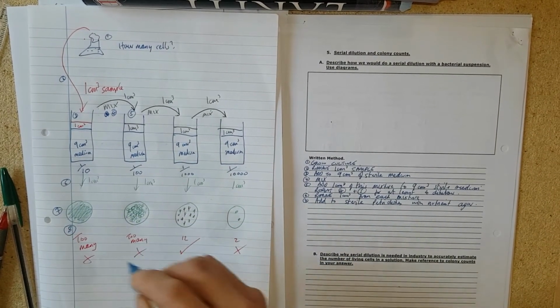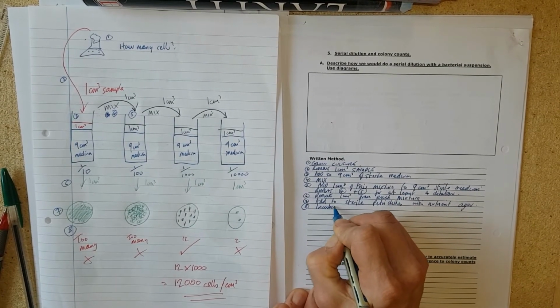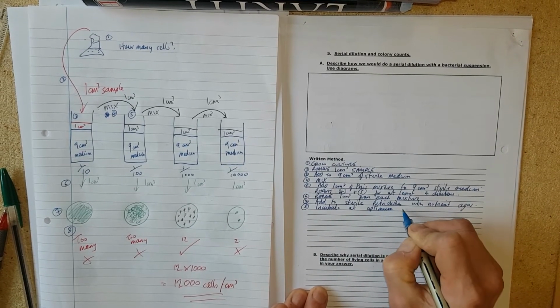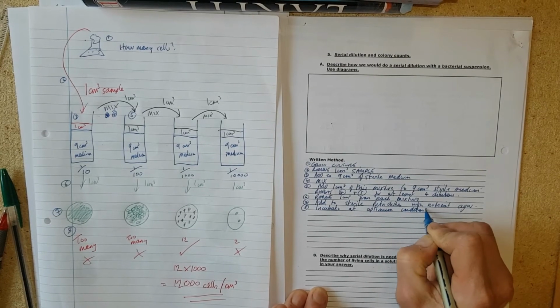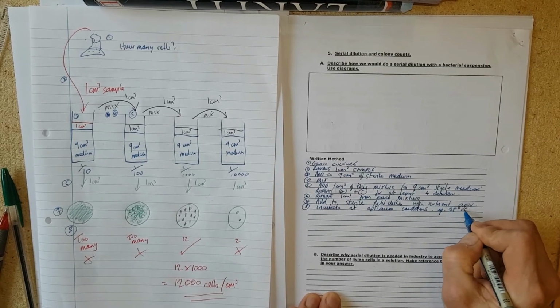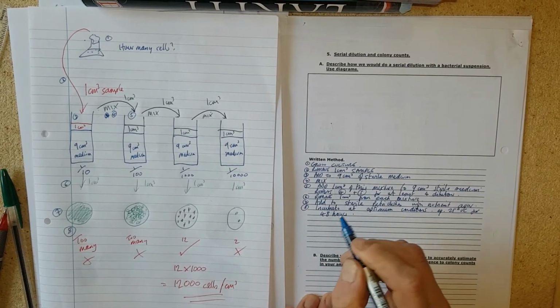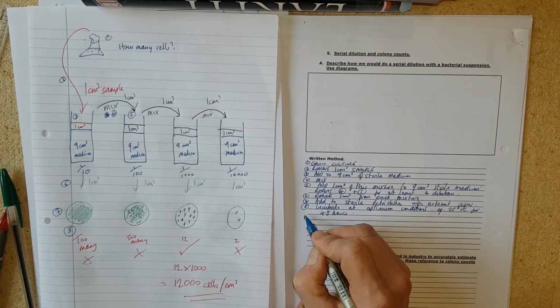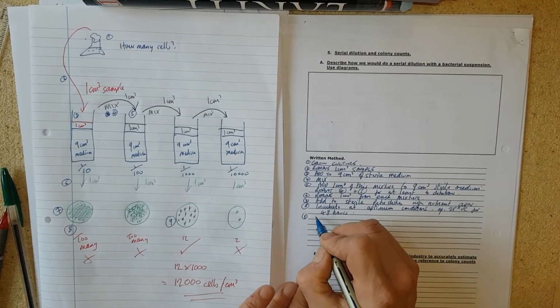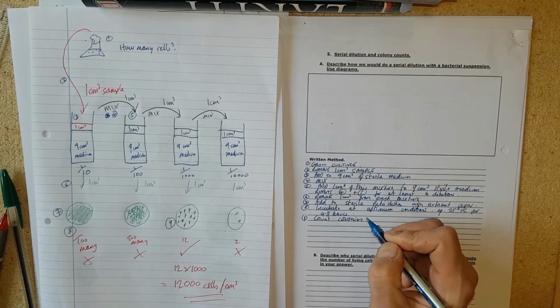8 will be leave it in the right conditions to grow. So 8, incubate at optimum conditions. So for example, it might be 25 degrees C for 48 hours. 9 is do your counts. So count colonies.